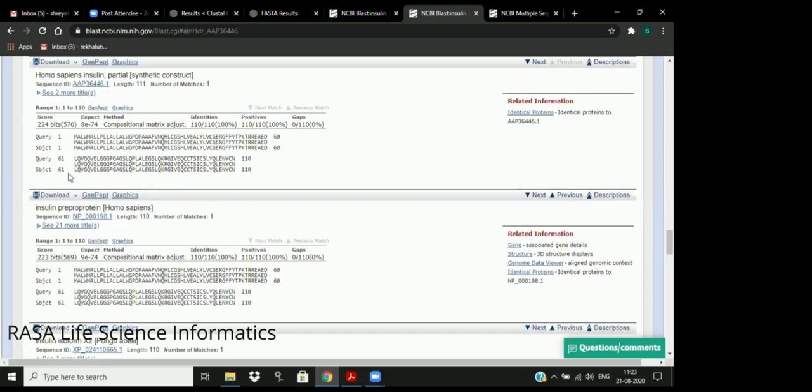Now let us understand how the alignments can be analyzed. I told you that every tool has its own descriptors. So BLAST also has its own. Yesterday we discussed the descriptors used by Clustal. So what about BLAST? BLAST gives you two types of results, similarity and identity.